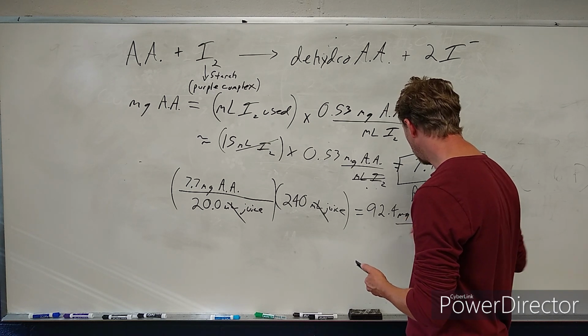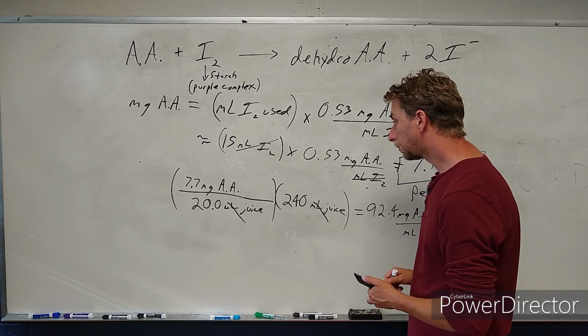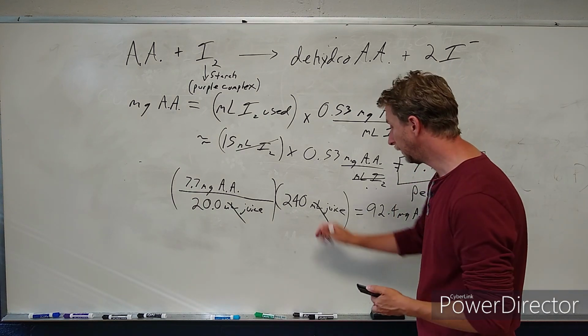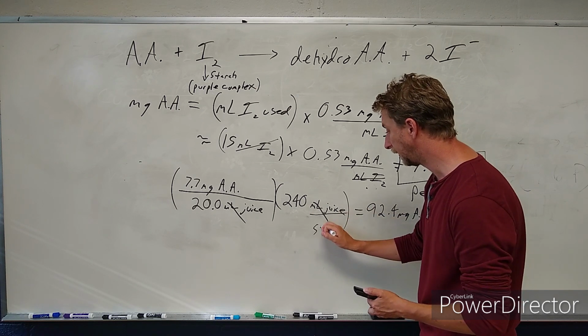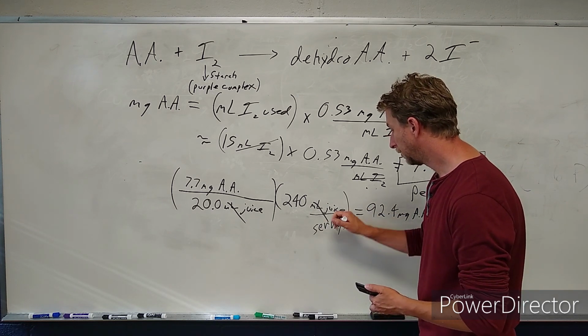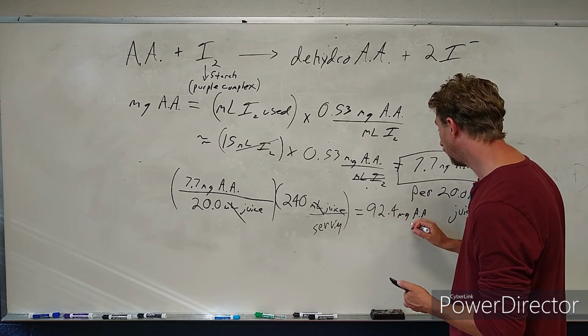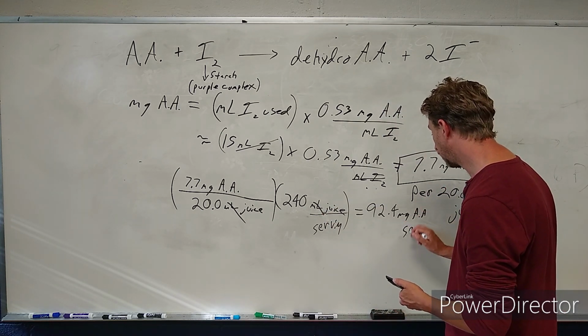And that'd be per milliliter of juice. I'm sorry, well, per serving, because we canceled the milliliters, and this is milliliters of juice per serving right here. So you'd have milliliters canceled and say 92.4 milligrams of ascorbic acid per serving.